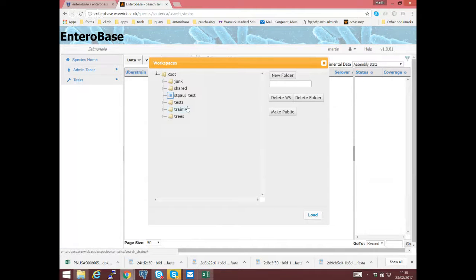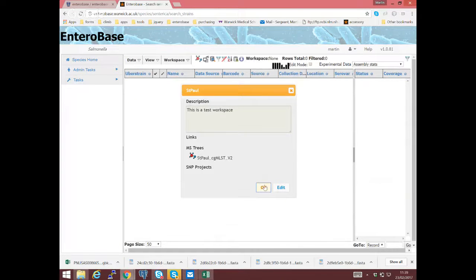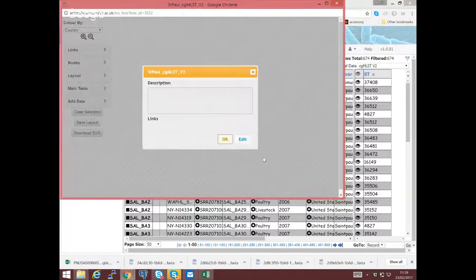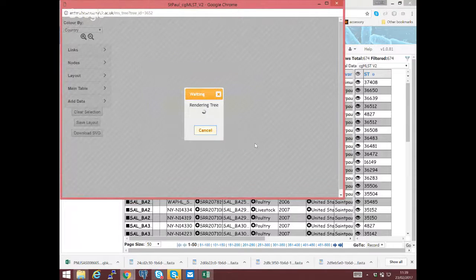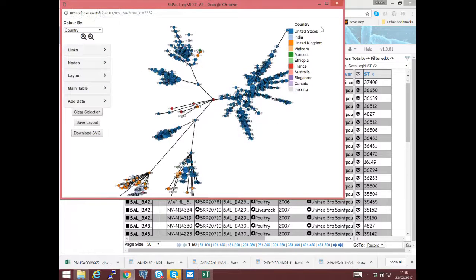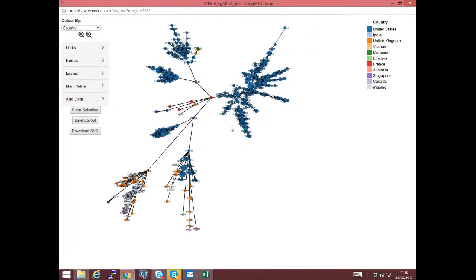I'll have to look into that. However, last night I did create one, as you can see. So we will load that one. Okay, so this is one I created last night.